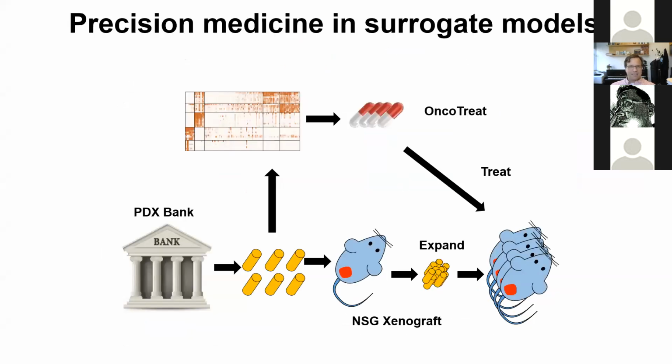I'm going to show you an example of that from my own laboratory. We're beginning to build a pancreatic cancer PDX bank specifically with my laboratory, and we have about 10 models now that have been established. I'm pretty sure that we have a near 100% engraftment rate at this point. Pancreatic cancer is known historically for having a high engraftment rate, but our core facility does take a particularly aggressive approach in implanting tumors into orthotopic sites.